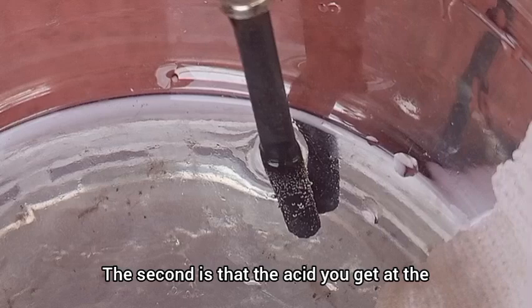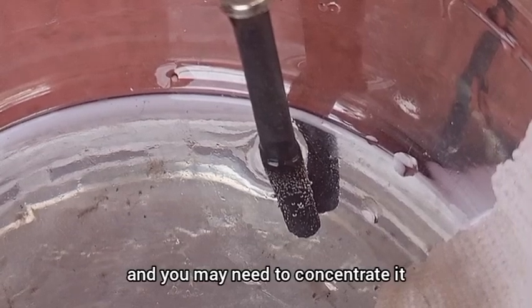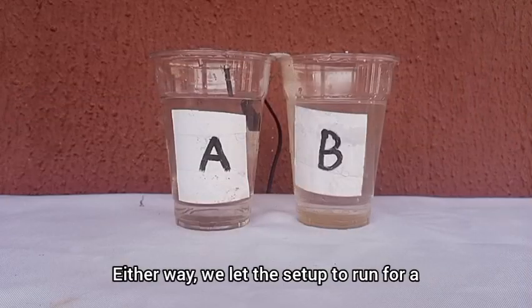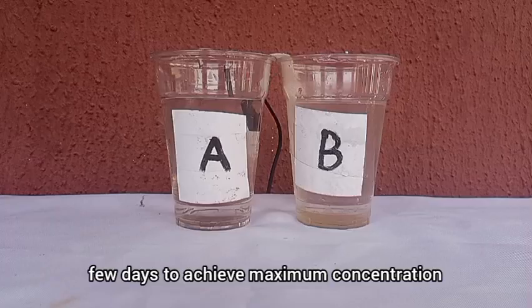I don't have any of that at the moment so I'm stuck with graphite. The second limitation is that the acid you will get at the end of this process will be very dilute and you may need to concentrate it. Either way, we let the setup run for a few days to achieve maximum concentration.